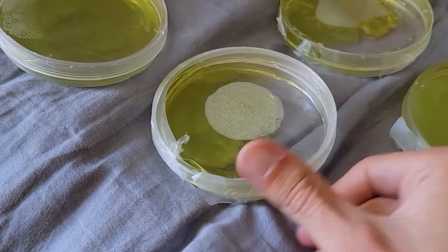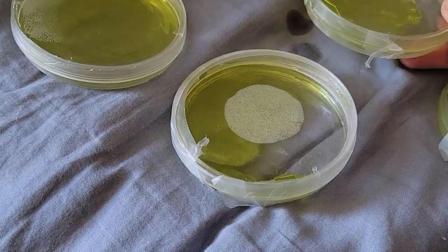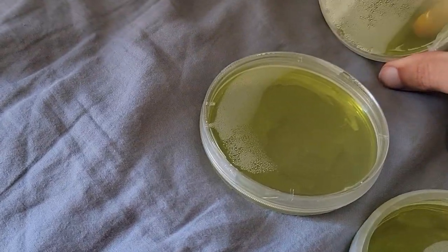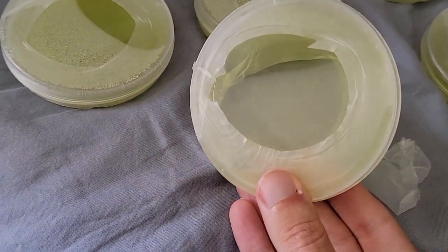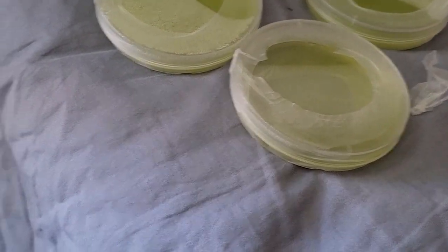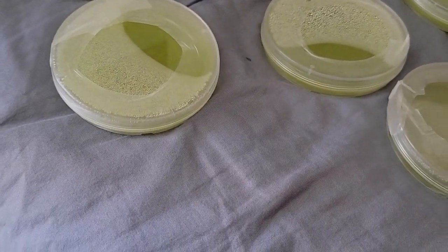As you can see here, due to the uneven mixture of the agar liquid, some of them are more solid than others, and some of them didn't even solidify. Like some of these, they're not even solid, they're liquid. And this one seems a little clearer than it should be, whereas the other ones are more green. So next time I'm going to make sure it gets more evenly distributed.